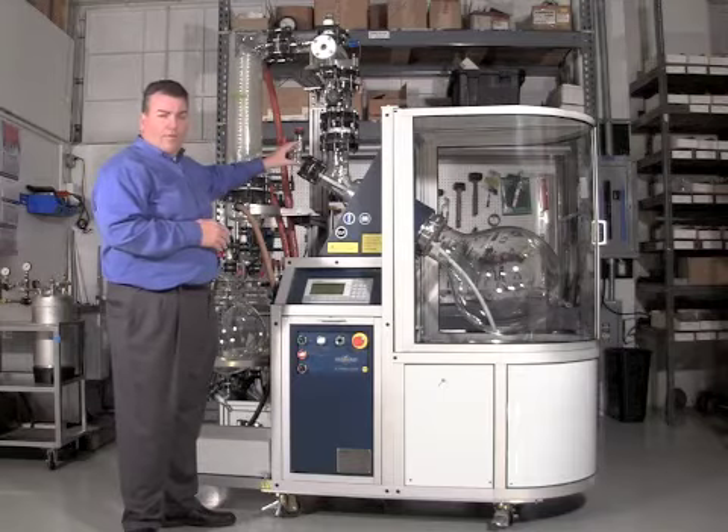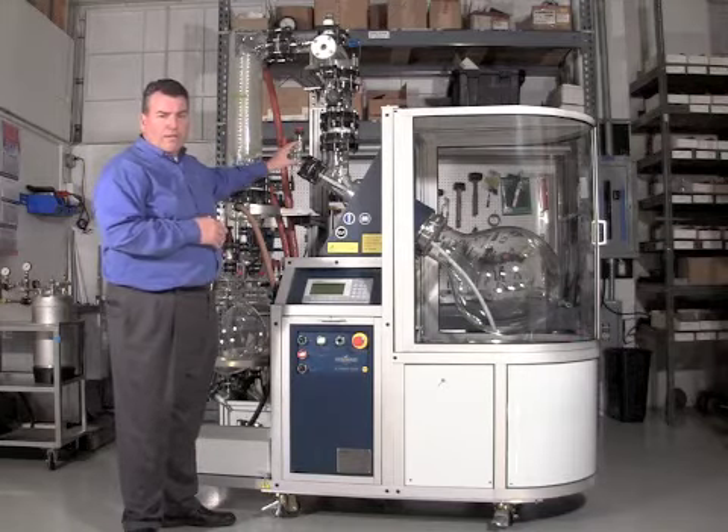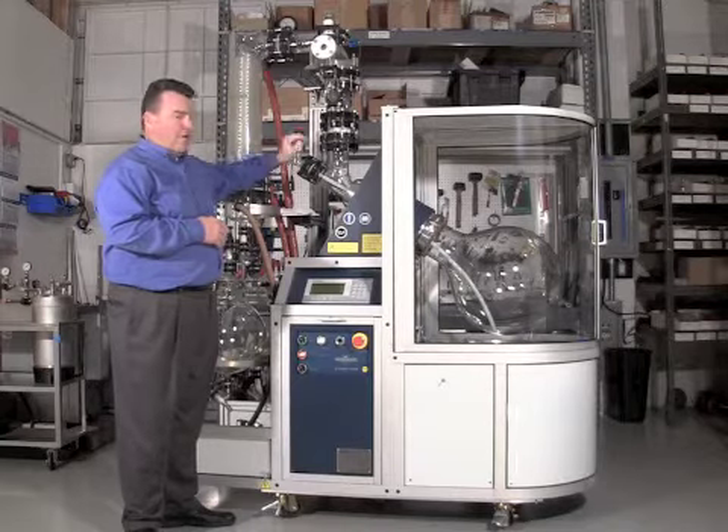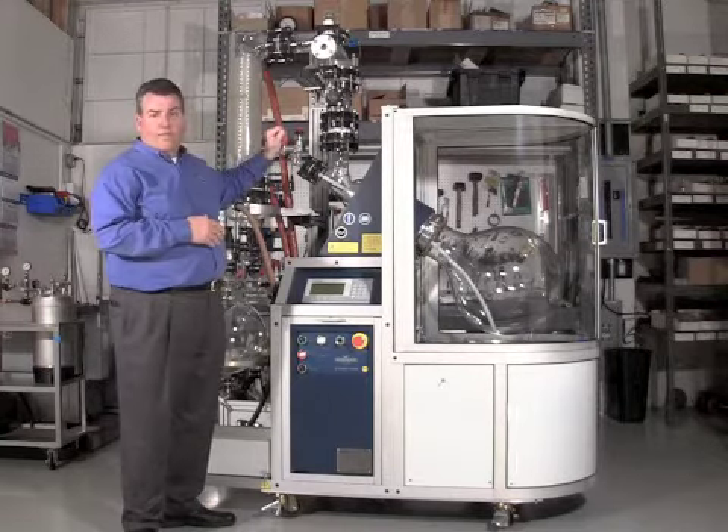This is a fill valve to fill the evaporation flask. This is a valve that can blanket the evaporation flask and the whole unit with nitrogen.